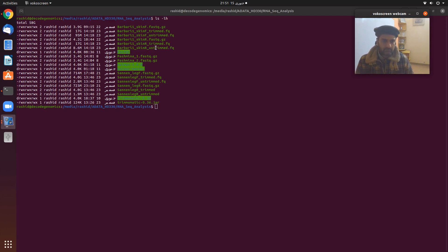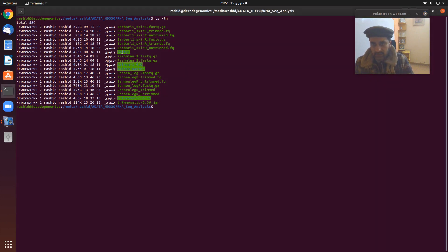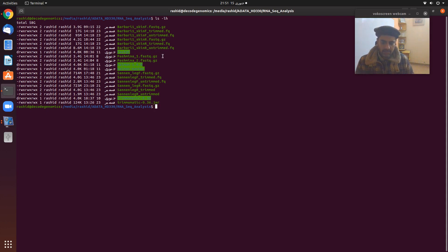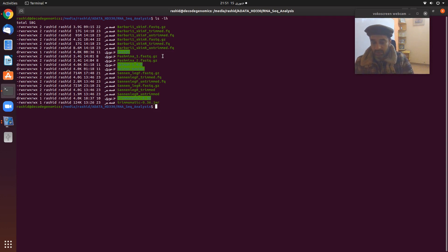For this quality check step, there are many software options available. What we are using here is FastQC, which I have already installed. There is also another software called MultiQC. You can use whichever is available to you, but for this step I am using FastQC.